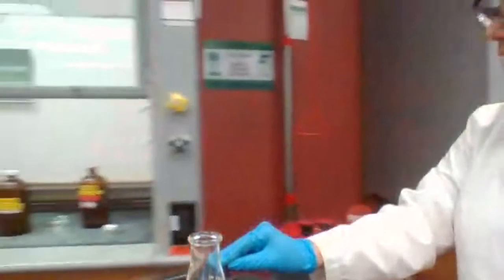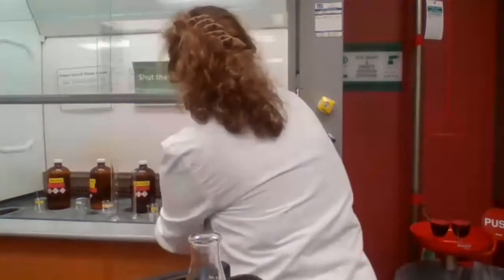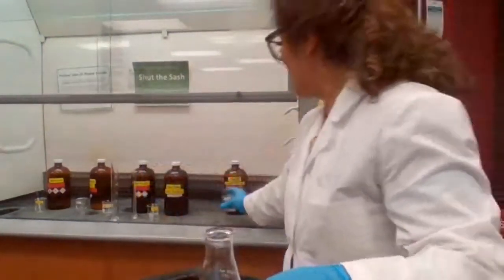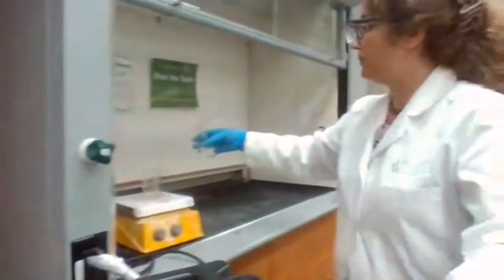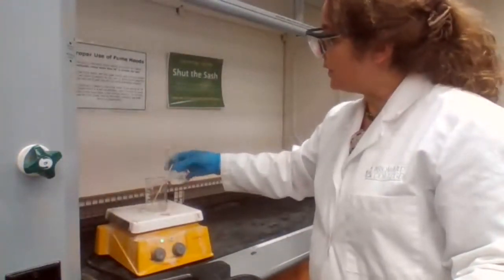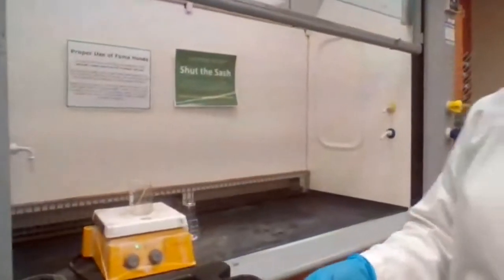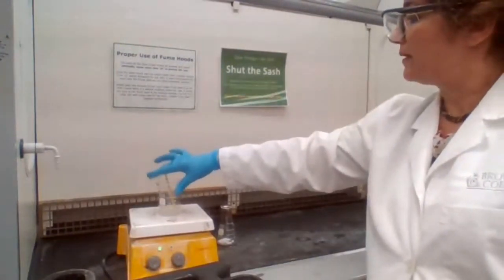Yes? Okay. If that is the case, then we are going to wash that with 3 to 5 milliliters. This is just trying to transfer every drop of the product into the beaker. So it does help percent recovery. So we wash the flask. We are going to, let's see, where is the light? To heat it up until it stops boiling.